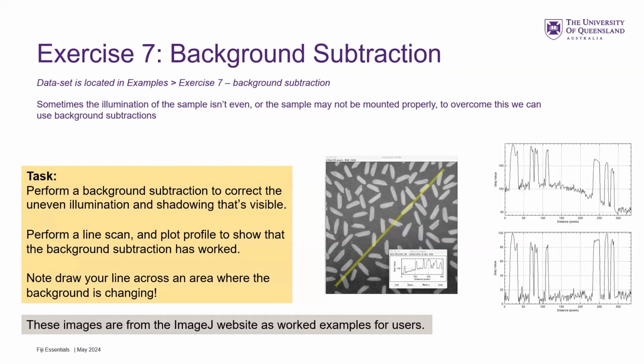I just realized that I haven't shown you how to do measure yet. So you just hit M and it comes up a table with the number. So you can draw a line over a couple of these of that short axis and figure out that they're all about 5 to 10 or 50 to 100. I don't actually remember. And then set your ball radius to be slightly bigger than that. And that would hopefully then give you something like this. Or a nice flat one, which I've just realized I haven't shown you how to do that either. So that's Command K or plot profile.